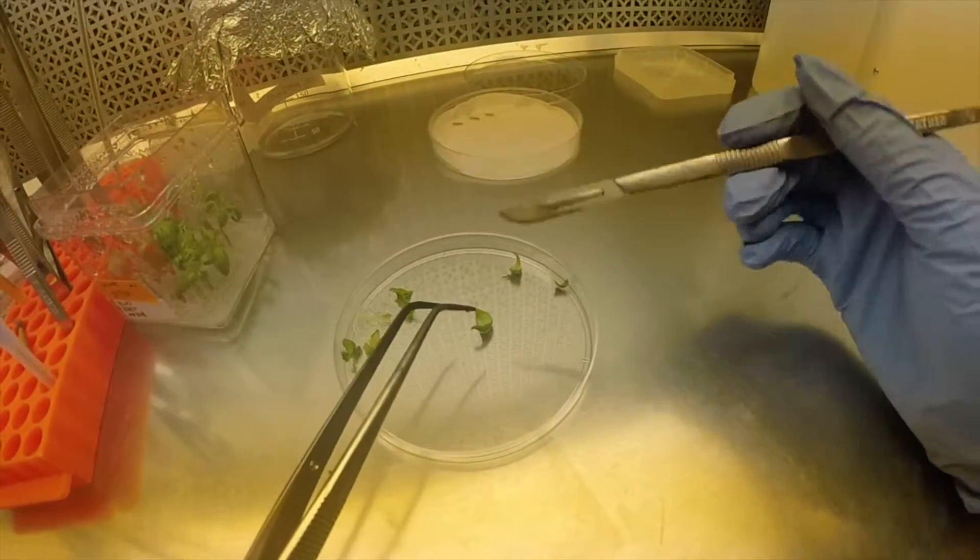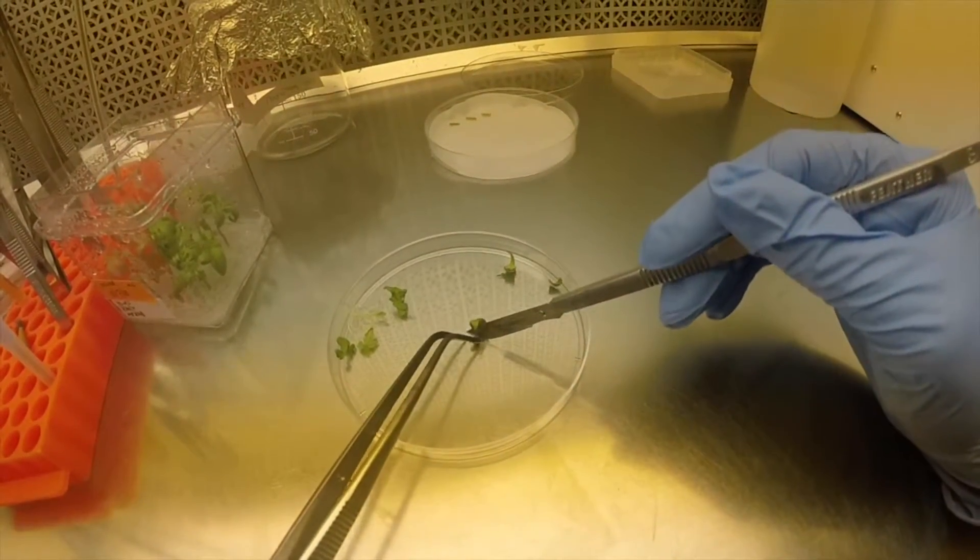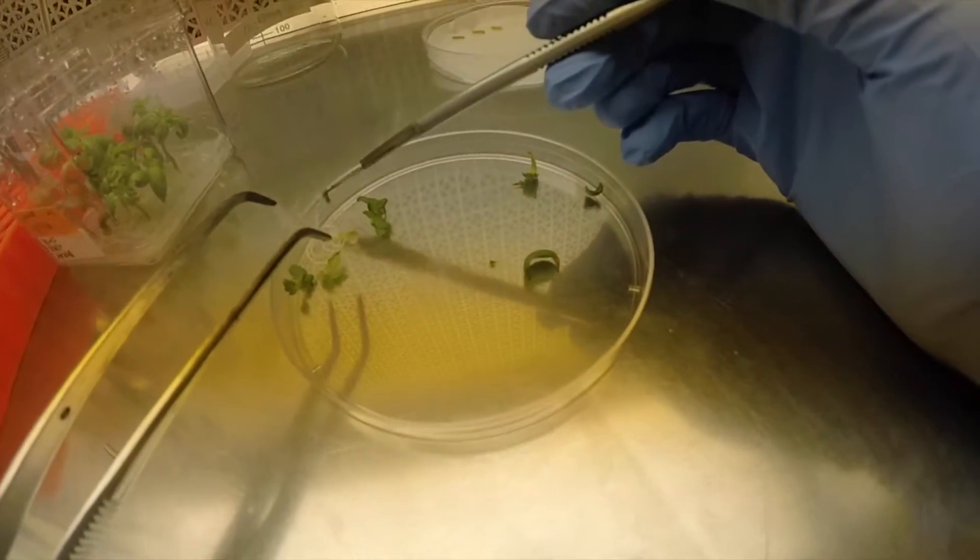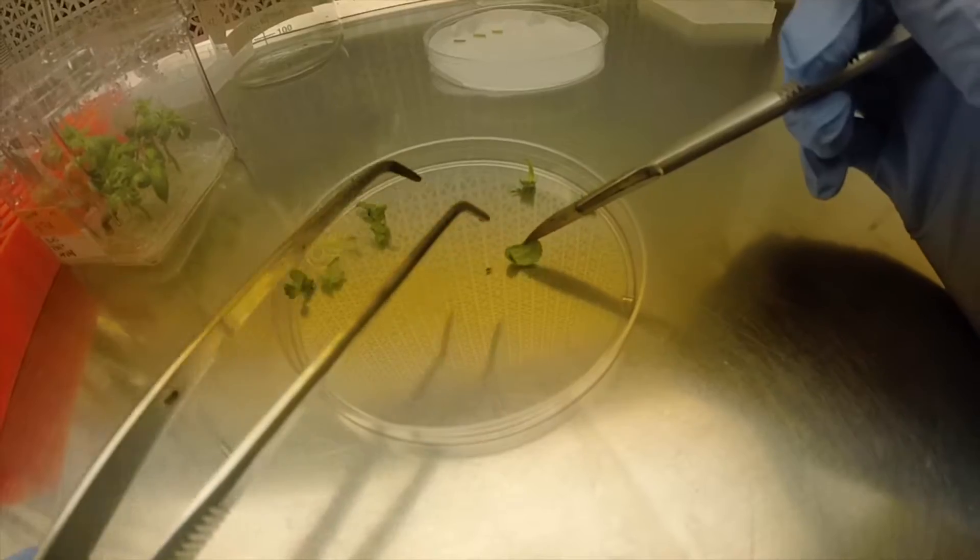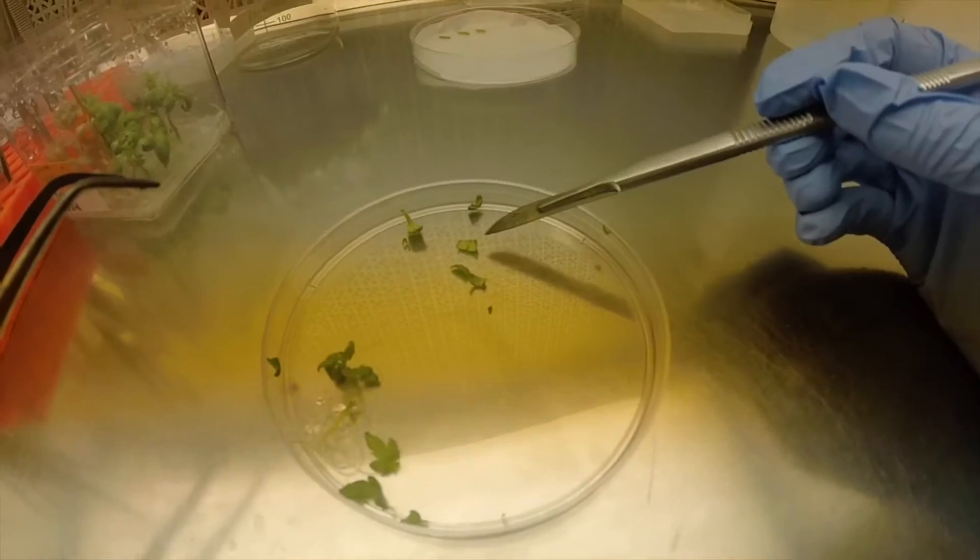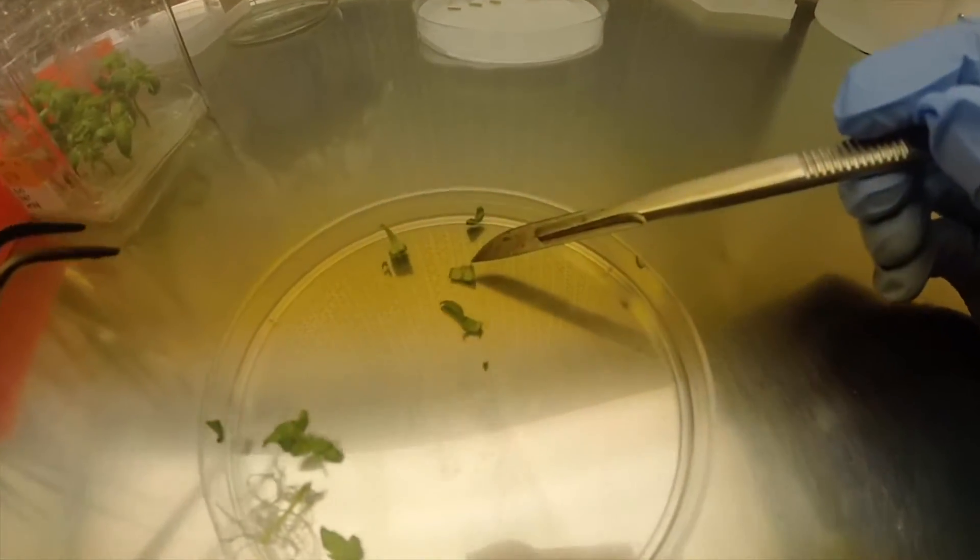We're going to start by cutting off the tip of the leaves like so and discarding that. About this size is probably about as big as we want to go, and even a little bit bigger would be fine as well.